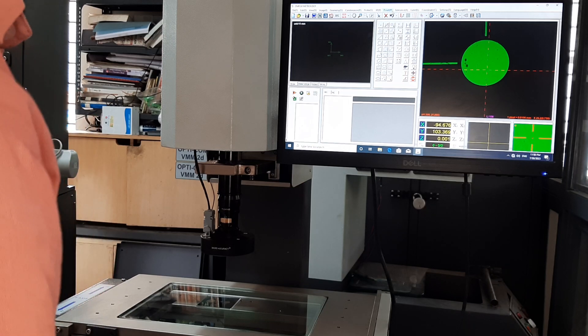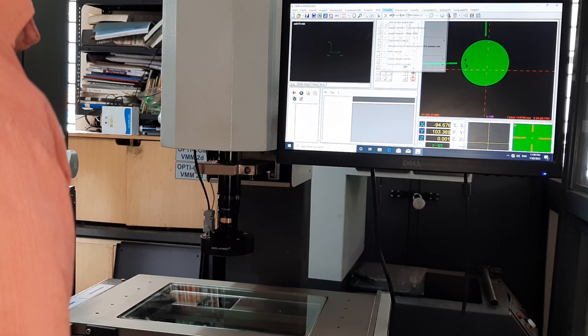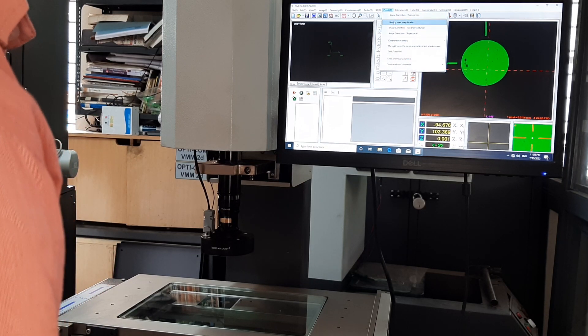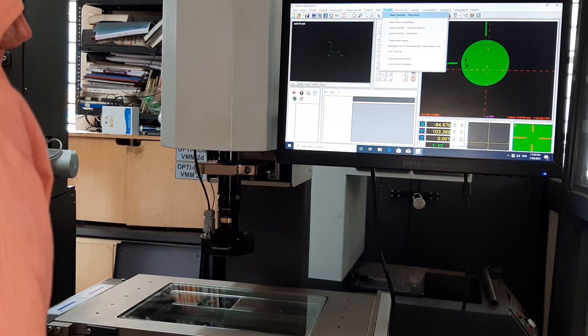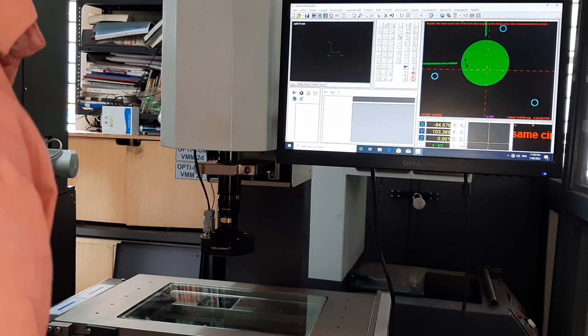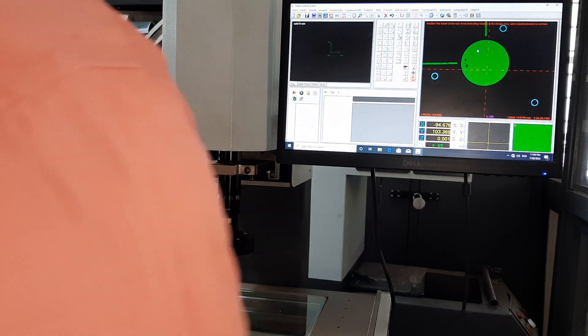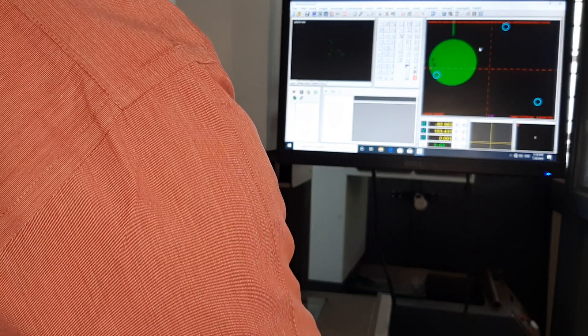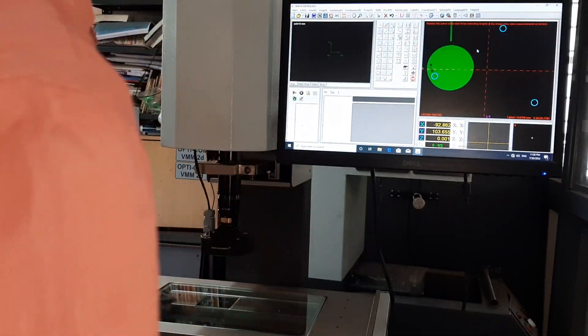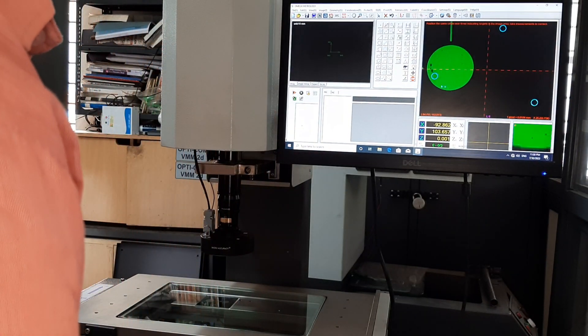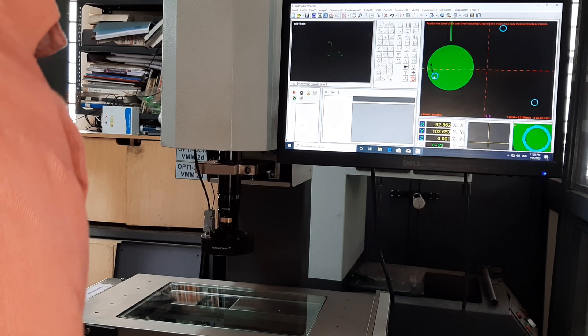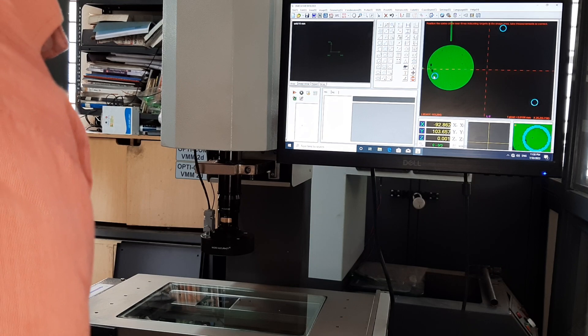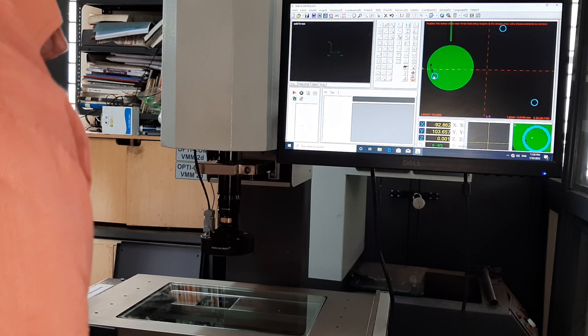Now you go to proof. Image correction, three circles. Move the circle inside the calibration circle. Left click.